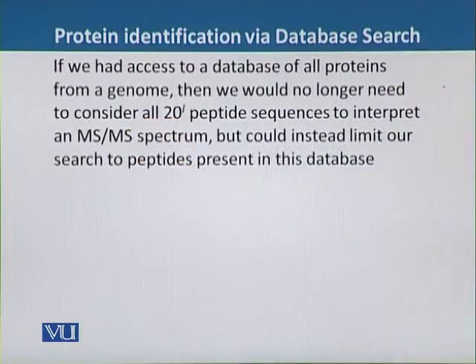If we had access to a database of all proteins from a genome, then we would no longer need to consider all peptides, that is, generate peptides of different sizes and sequences to interpret an MS-MS spectrum, but could instead limit our search to peptides present in this database.